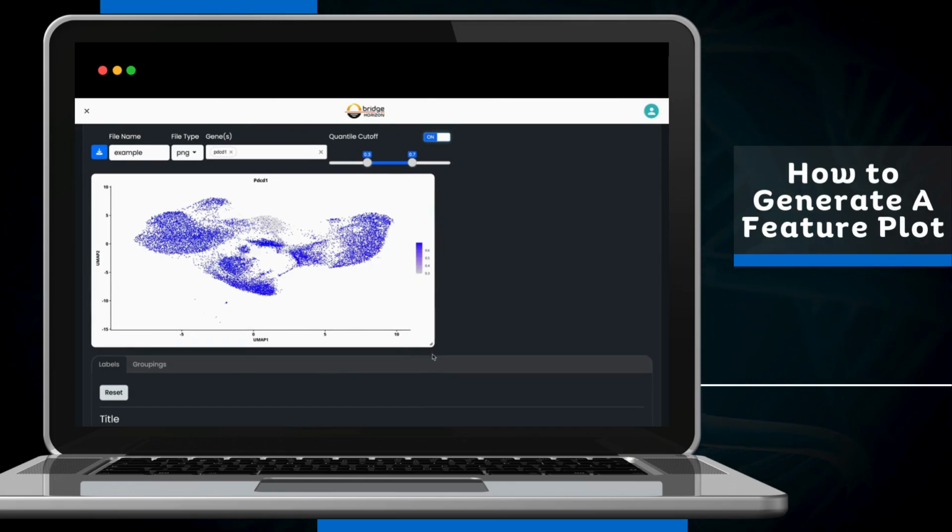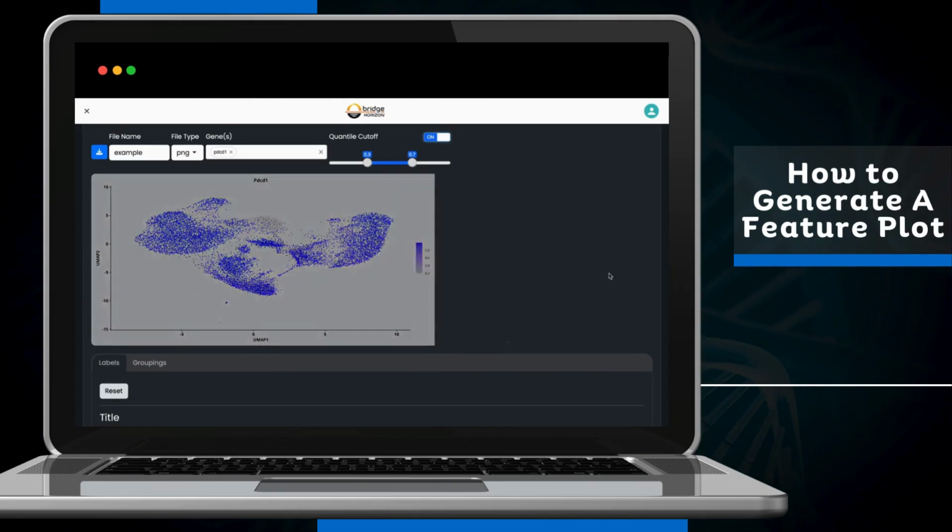And once again, in a similar fashion to violin and UMAP plot, in order to resize your plot, you can simply click at the bottom right hand corner and then drag your plot to resize.